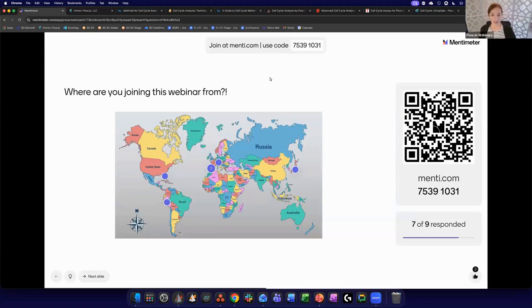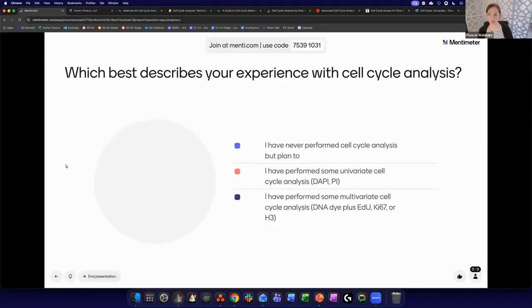Well, thank you for joining us today, where we'll be talking about cell cycle analysis, a broad overview of applications, the assay, and a little bit more focus on the analysis since we're discussing this in the context of a FlowJo webinar. But before we start, I always like to get a sense of not only where everybody is joining us from, but also everybody's experience level with the topic.